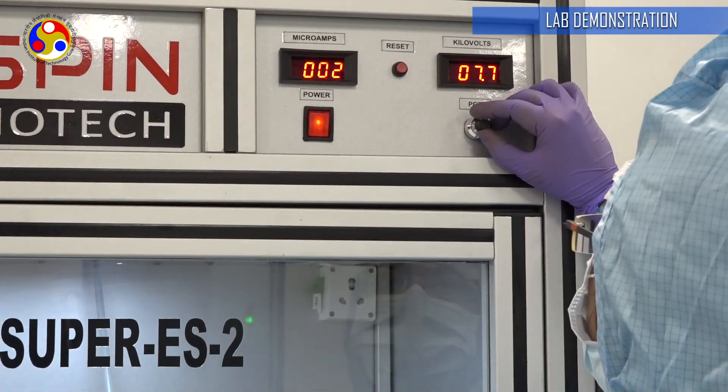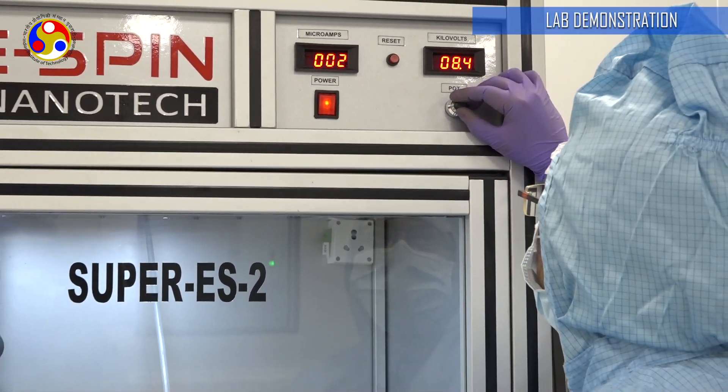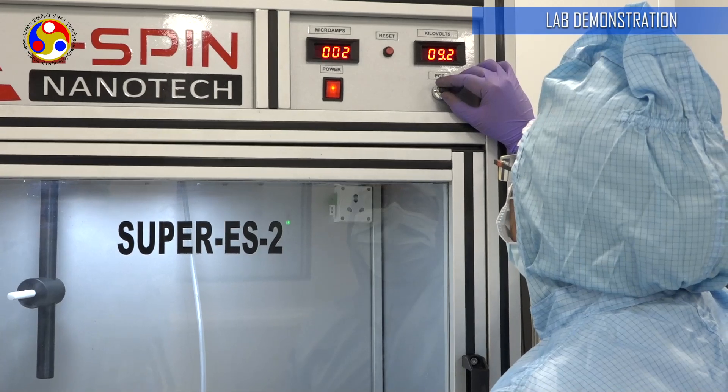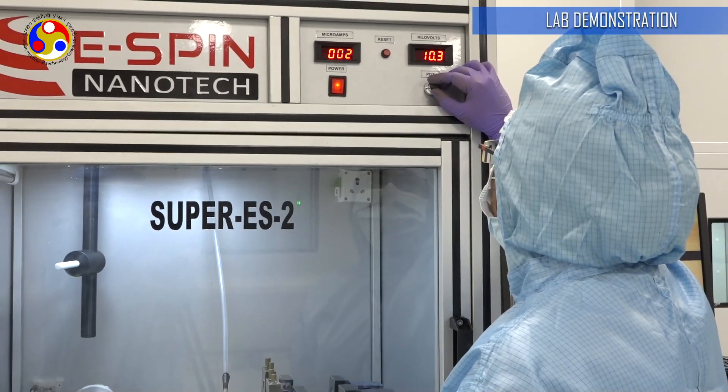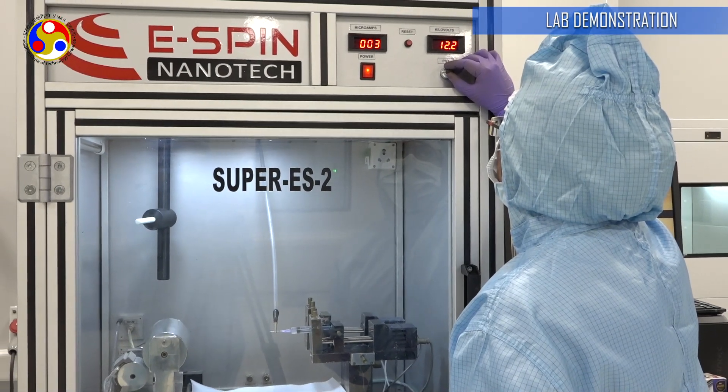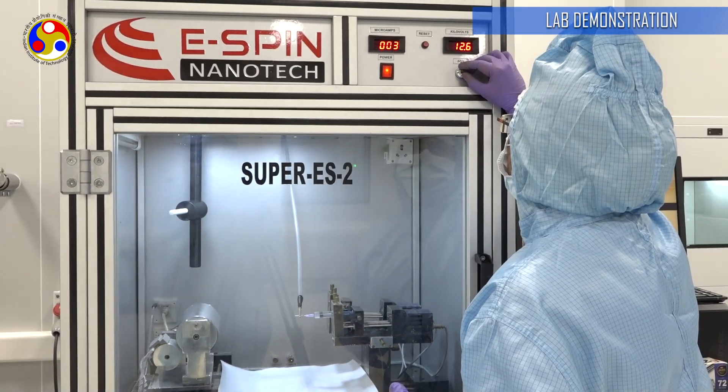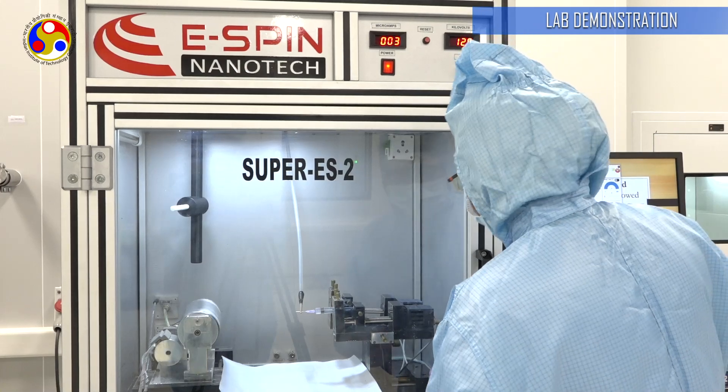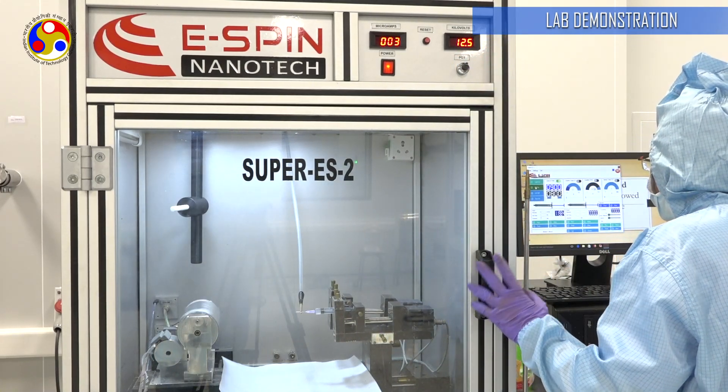Typically we keep the value of this below 30 kilovolts, but again that will depend on the sample requirements. I am just going to keep it at 12.5 for the purposes of this demo, no more is needed.